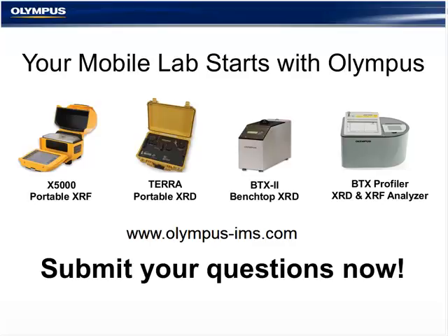Okay. So field XRD and XRF, it's not only ideal to make fast drilling and geosteering decisions in real time, it's also a cost-saving screening method to reduce the amount of samples you may have to actually send into a lab. A lot of times when you're sending enormous amounts of samples into the lab, it takes an enormous amount of time to get them back. And sometimes you really need some information just in some specific zones. So you can get through a lot of samples at a reduced cost.